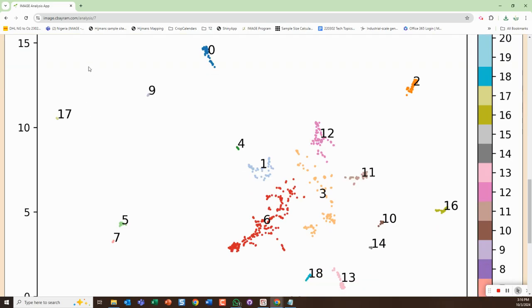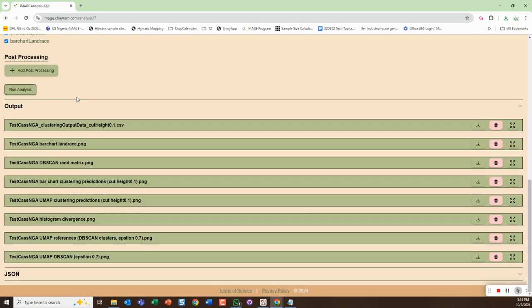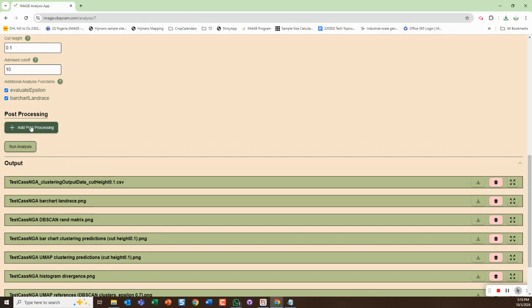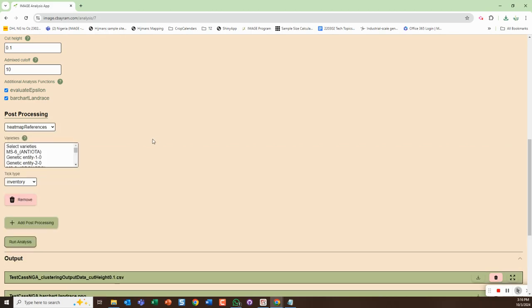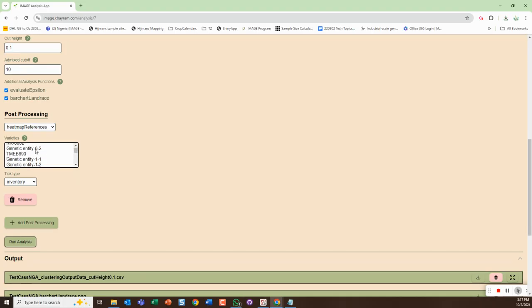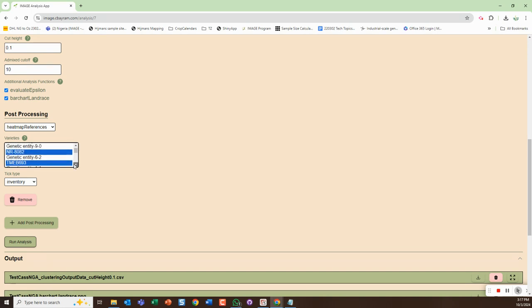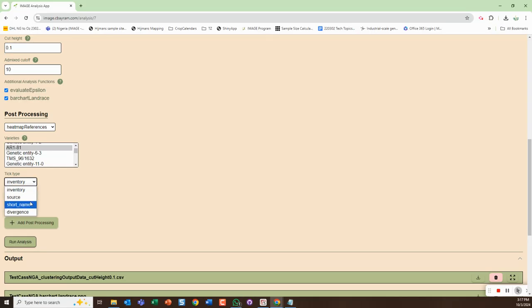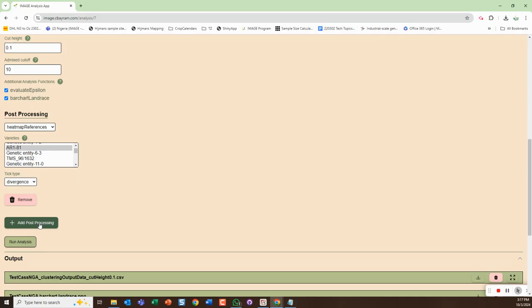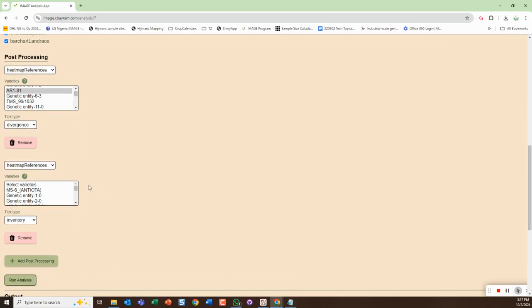We can just minimize those so they're sort of easier to see. Then we can do post processing items. If I wanted to do a heat map of a few different items I could select them here using control, and that will then do it for these three. I can choose my tick type here, so I'm just going to go with divergence.